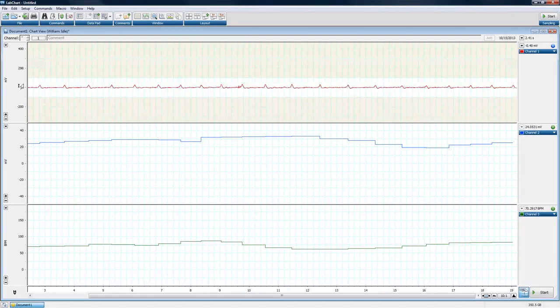The other thing you'll notice is if I move my cursor up and down, that cursor changes. It's not always a double arrow. Sometimes I have what I like to call a rewind button. You see that's shown here. It's just a bar with two triangles, and then you get the same thing in the other direction here, the fast forward button. And what that does is it locks one axis. In this case, it locks the axis toward the bar in that cursor. So in this image that you're seeing right here, the top axis will be locked, and if I click and drag, it'll only move the bottom axis.